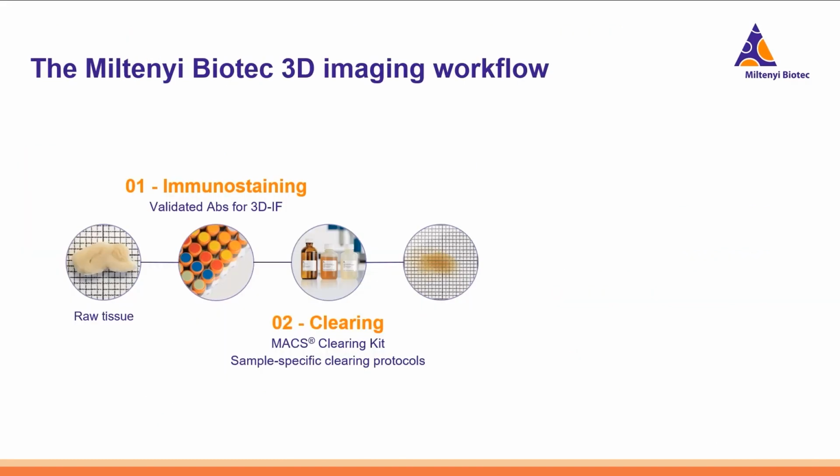So we fulfilled the first step. You beat the antibodies. I explained why we need to do the antibody labeling and also what would be the challenges. The second step is about clearing.